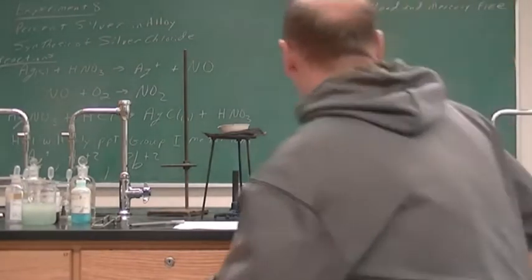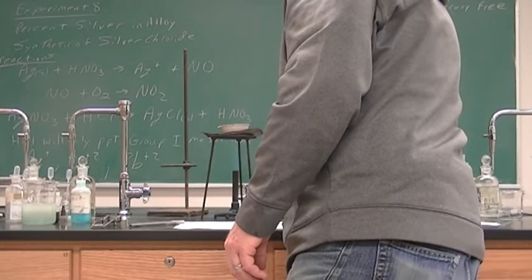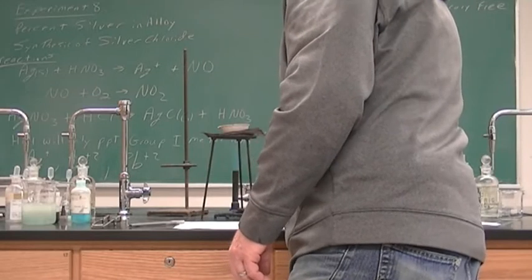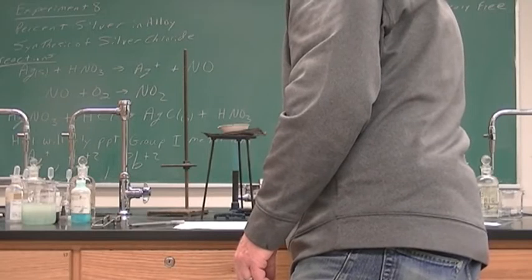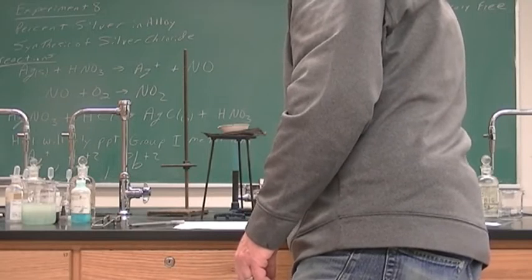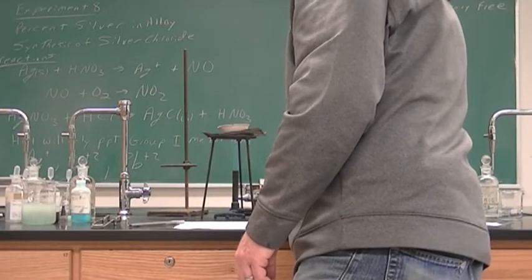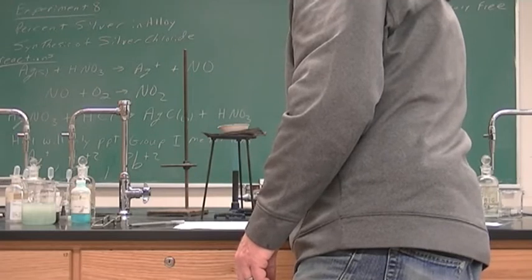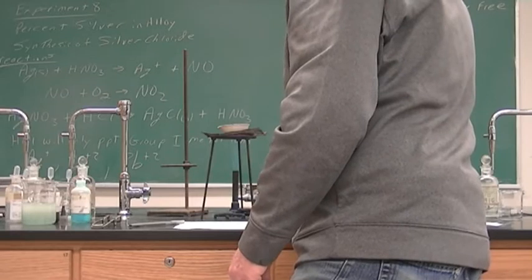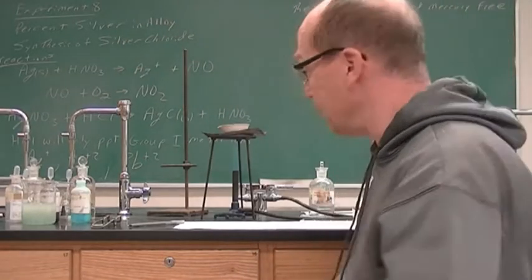All right, let's see how we're doing with our boiling. Crank it up a little more. All right, it's getting pretty close. If you have a fast forward button, you may want to fast forward to this.